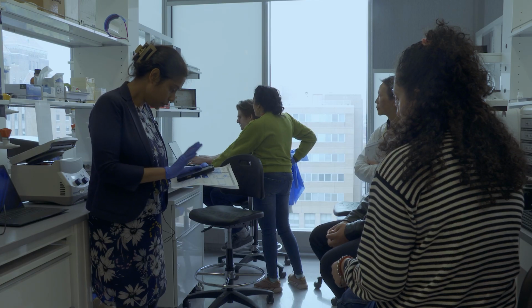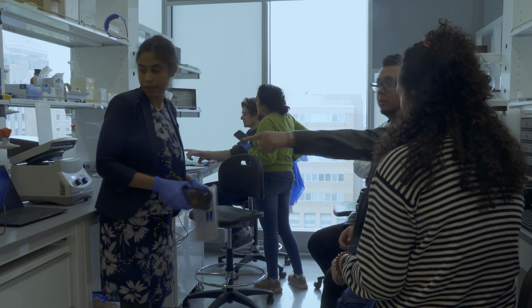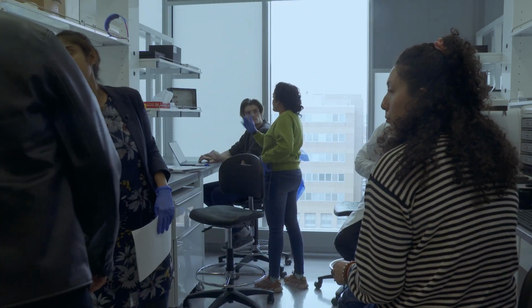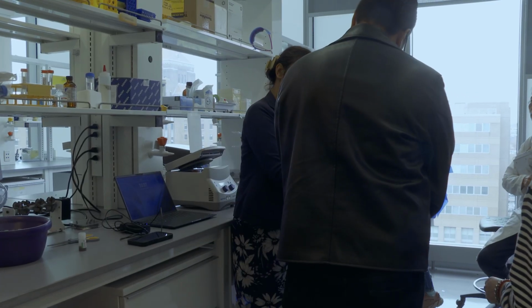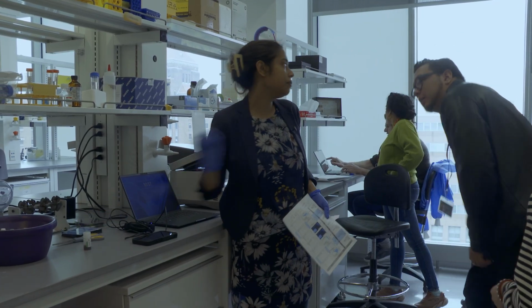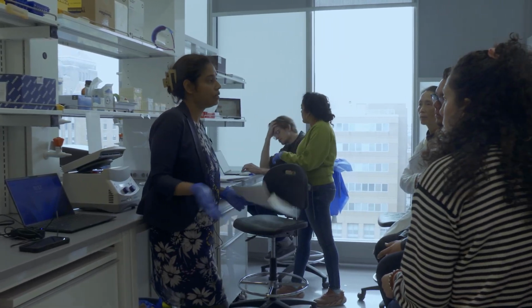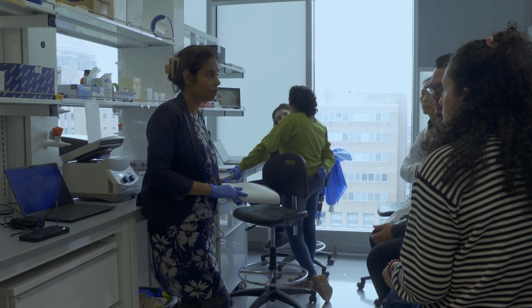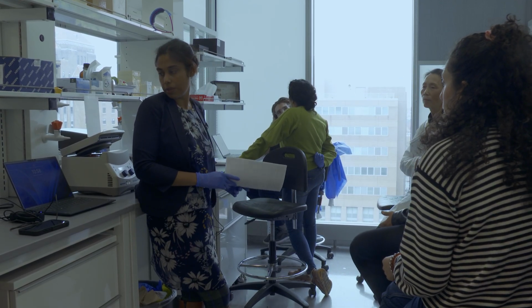Do you have any questions so far? What is that? Oh, this is the barcode plates. So, different barcodes. Because we are doing multiplexing, which means every sample should have a different identity, and that identity is the barcode. You can separate them. Otherwise, it would be mixed. So this is the barcode plate.